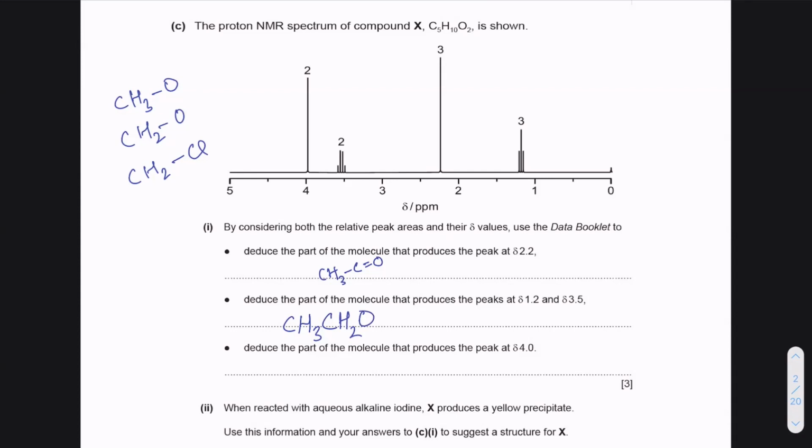Sir, I didn't get this. अगर हम ये नहीं कहेंगे कि like it has 2 hydrogens और फिर like इसके neighbor will be 2 या 3. देखो height से पता लगेगा इस पे कितने hydrogen. This carbon has 2 hydrogen. Yeah. सही है. तो ये वाला नहीं हो सकता. और the splitting is 4, that means neighbor में 3 hydrogen है. तो वो तो हम already establish कर चुके हैं.